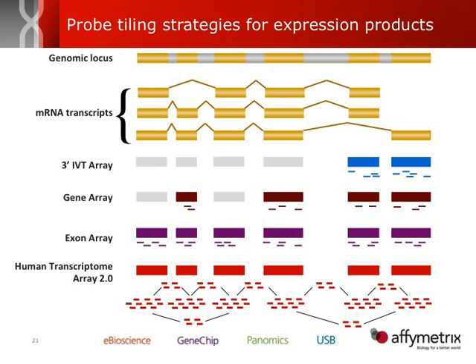Now there are 2 more levels of information that we can look at to make sure that this splicing event is truly happening. Because exon 2 is no longer present, there won't be a junction between exon 1 and exon 2, and the same thing for the junction between exon 2 and exon 3. With no exon 2, there's no junction between exon 2 and 3.